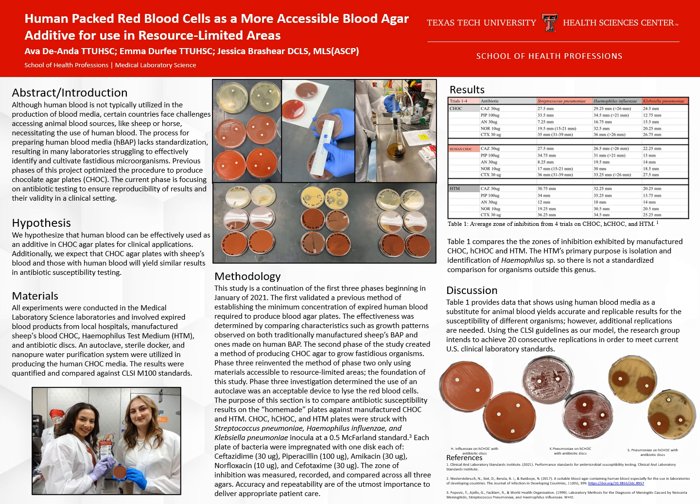Many fastidious microorganisms, such as certain species of Haemophilus and Neisseria, require specific nutrients found in red blood cells, which are more readily available in lysed blood. Lysed blood releases these nutrients into the agar, making them accessible to the microorganisms. For diagnostic purposes, lysed blood media can also aid in distinguishing between different types of bacteria based on their hemolytic patterns. This can be especially useful in identifying and classifying bacteria in clinical samples.